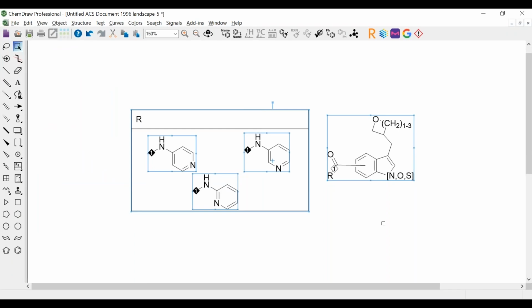You can use the ChemDraw for Excel plugin in order to view everything in that particular SD file. But again, another way for you to work with your cheminformatics information in that cheminformatics language. I can take these things and instead of having to draw out all those structures and then translate each one individually into a SMILES string and put it in a spreadsheet, I can just automatically send these things into a spreadsheet and then send that off to somebody so that they can use it for downstream consumption.